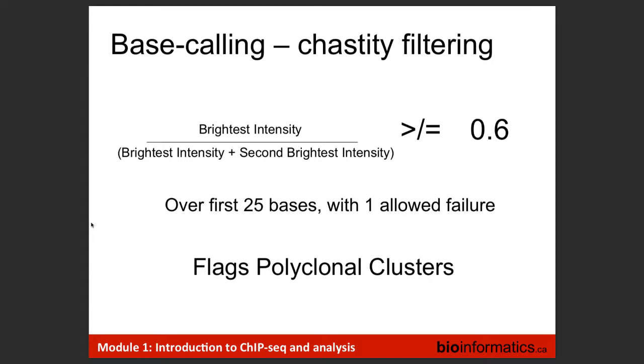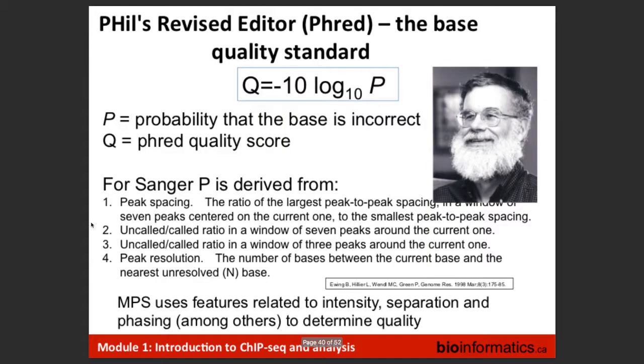Of course, single molecule sequencing technologies, let's use the example of Oxford Nanopore, have a bigger problem because they're not making a consensus call of that cluster. They get one determination of what that sequence is, and that's it. Whereas with Illumina and other clonal-based platforms, you're basically taking a consensus call, and that gives us the higher qualities that we see on the Illumina platform versus single molecule technologies like PacBio and Oxford Nanopore. They don't have that consensus call. So that's a real fundamental difference between the two.